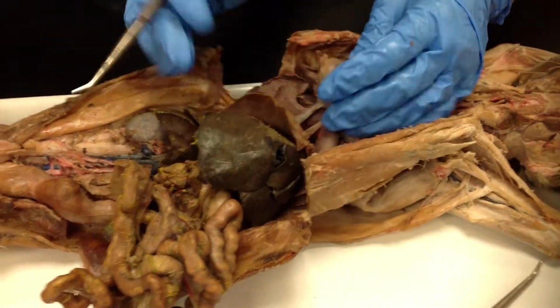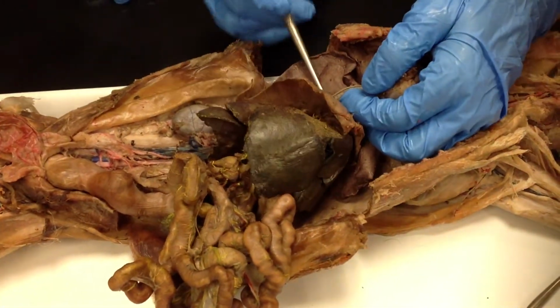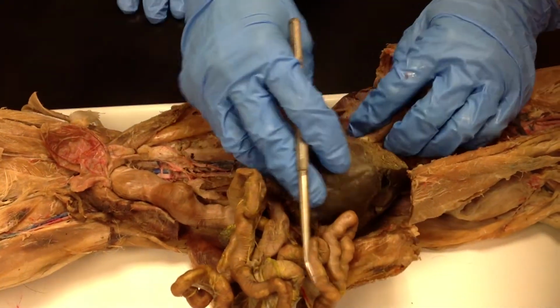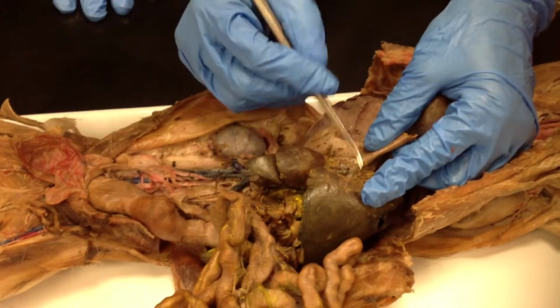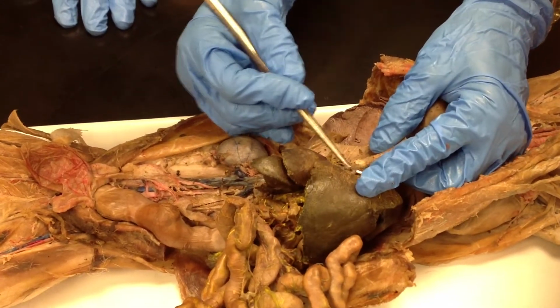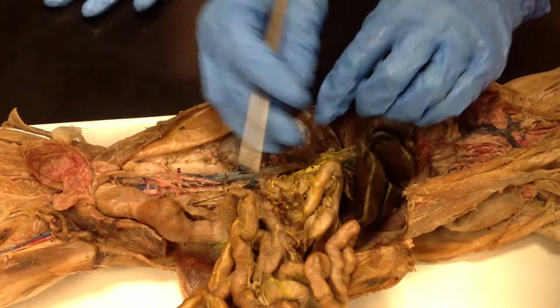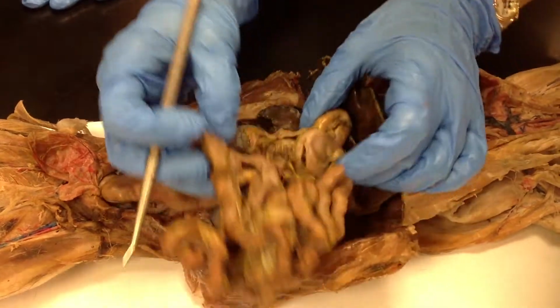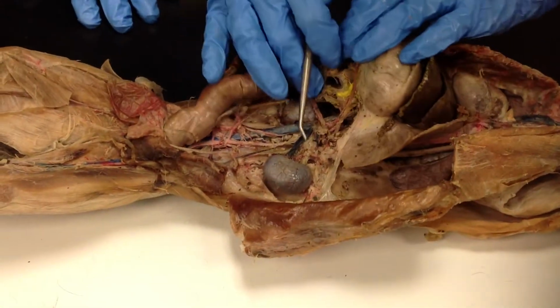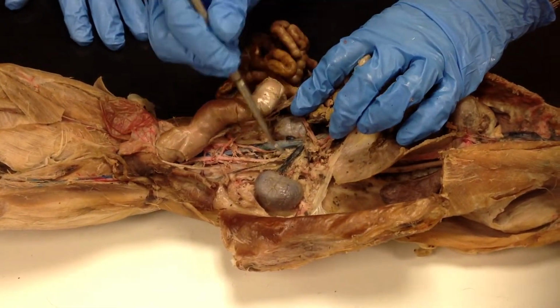And now let's see what we can see coming down here. Okay, so this is your inferior vena cava coming down here. And you can see your hepatic veins right here, going into the liver, coming out of the liver. All right. And coming down here, we're not going to be able to see too much. Again, here's your vena cava coming down. The big ones we can see.